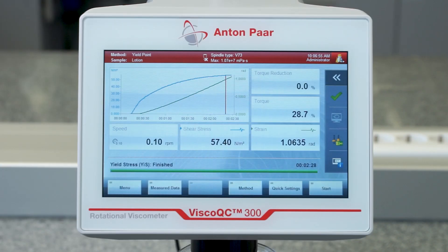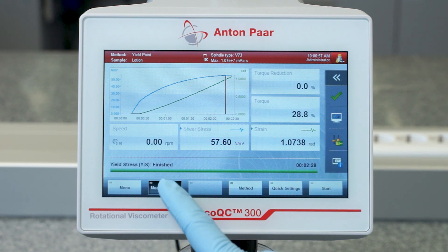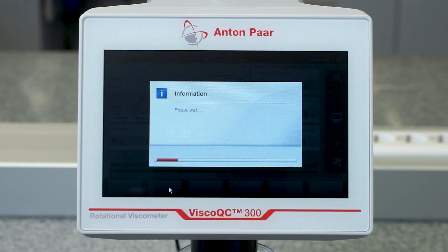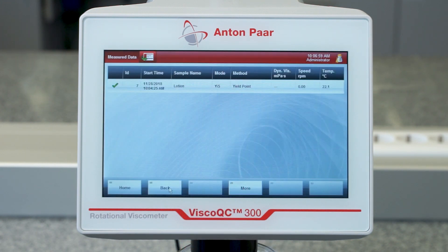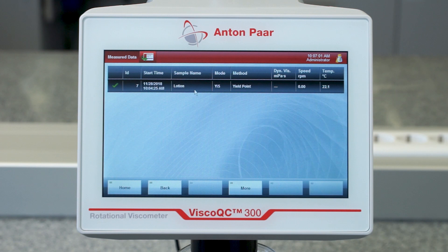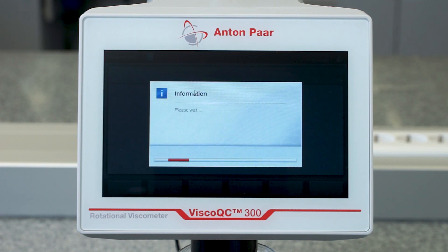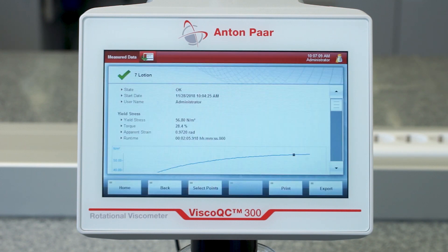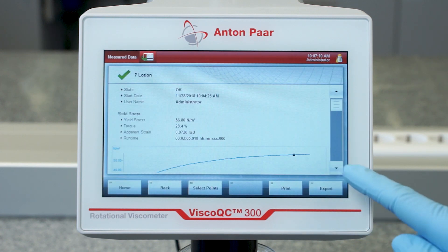As soon as your measurement is finished, all data can be found in the data memory. The static yield stress determined with vane spindles is automatically calculated.